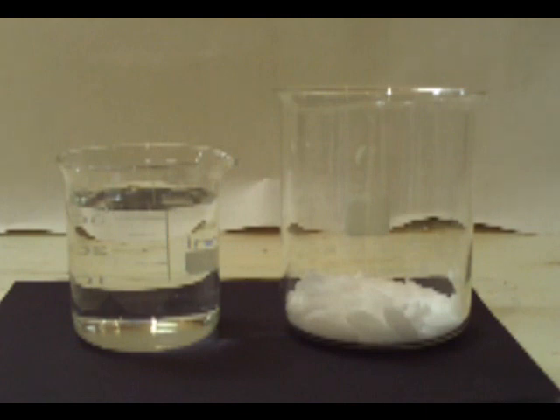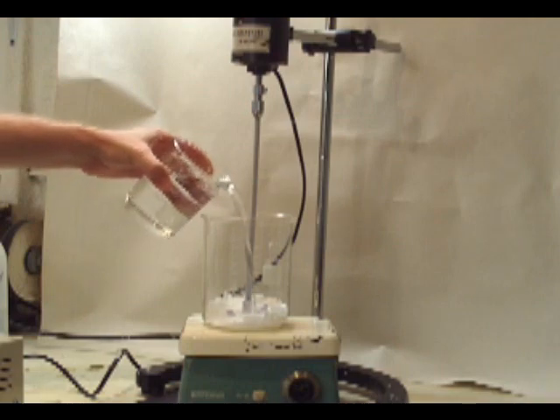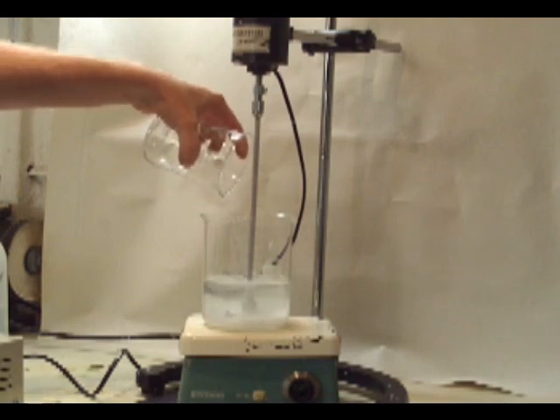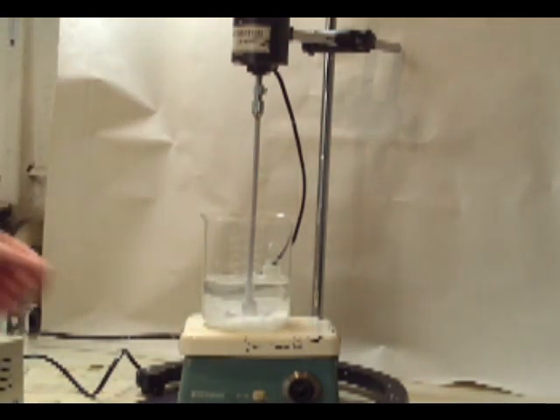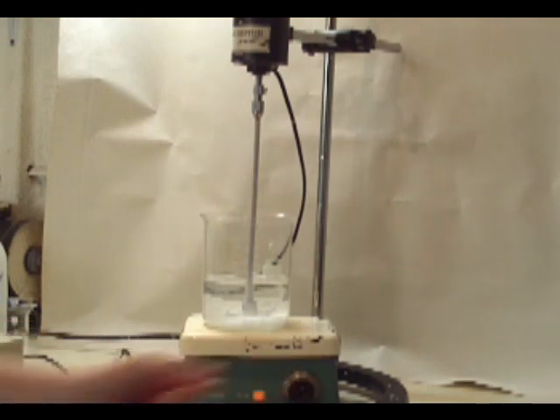On the right we have our 240 grams of potassium bromide and on the left we have our 400 milliliters of water. We're going to mix these two together and dissolve the potassium bromide. We're going to start by setting up an overhead mixer — you can use whatever means you like. You probably won't have any luck with a magnetic mixer because that 240 grams of potassium bromide is a little too much for them to move, but you can get it dissolved however you like.